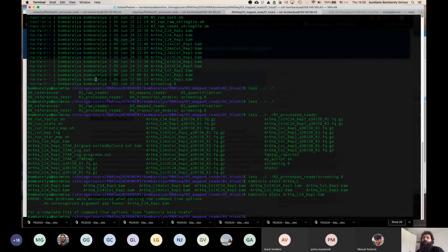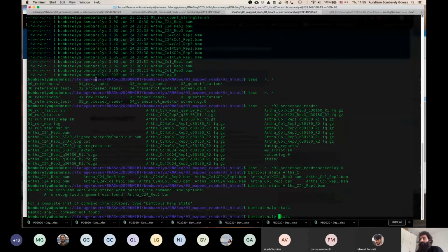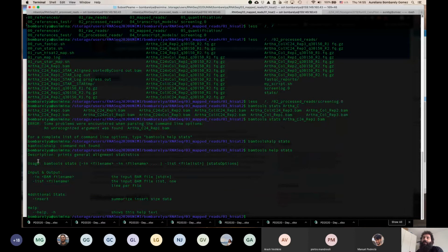Because an unrecognized argument was found. So yeah, probably I'm running this the wrong way. It told me, okay, type bamtools help stats. If I do this, it's telling me, yeah, by the way, you need to use -in. So I go back. I add the -in.